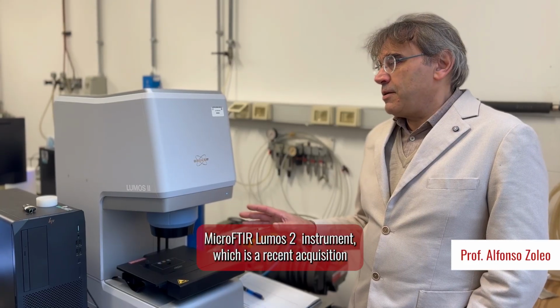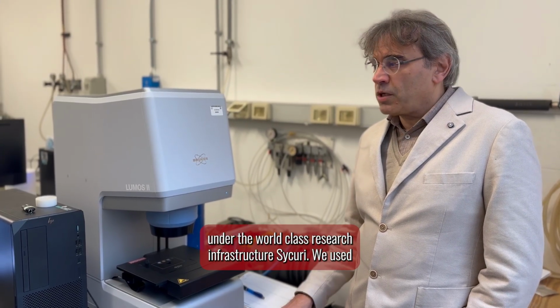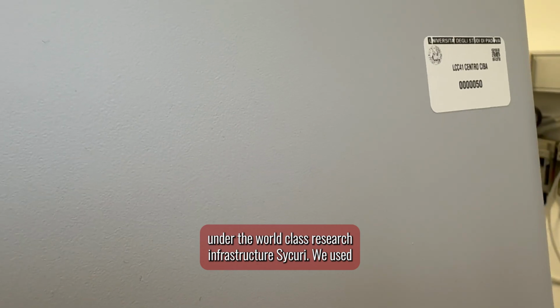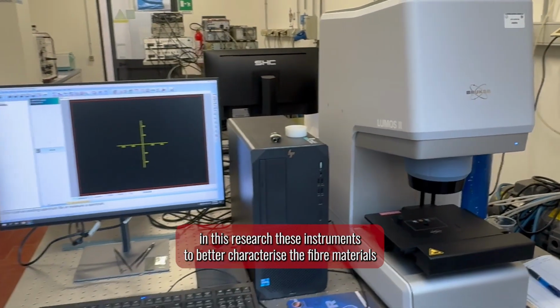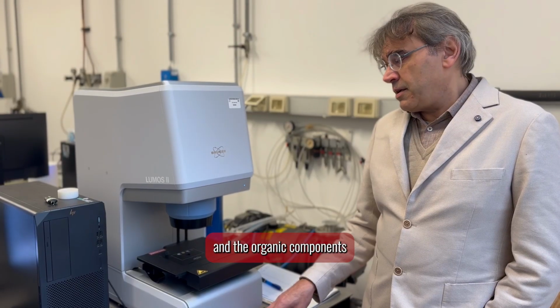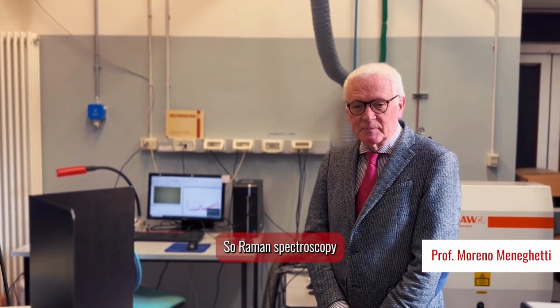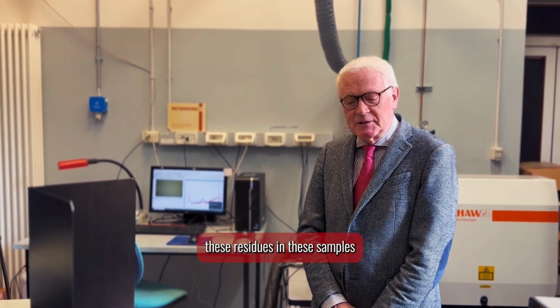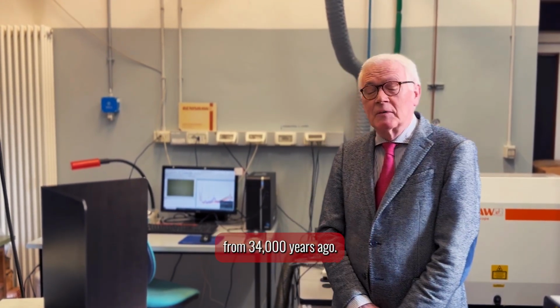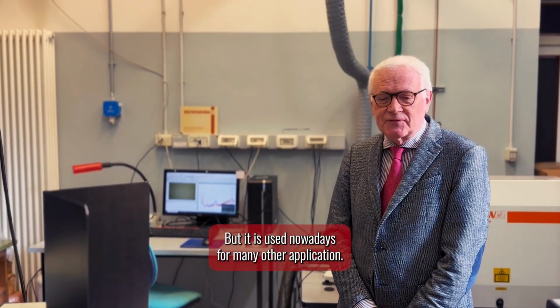This is a micro-FTIR Lumos 2 instrument, which is a recent acquisition under the world-class research infrastructure Sicuri. We used these instruments in this research to better characterize the fiber materials and the organic components present inside the materials we have analyzed. So Raman spectroscopy was used in this case to identify these residues and these samples from 34,000 years ago. But it is used nowadays for many other applications.